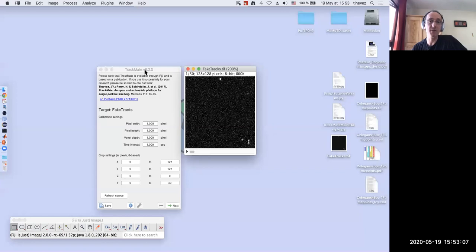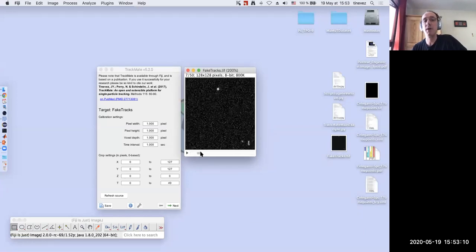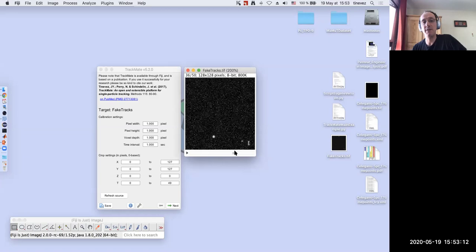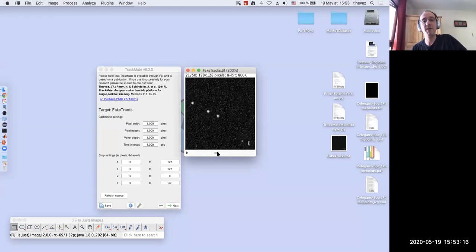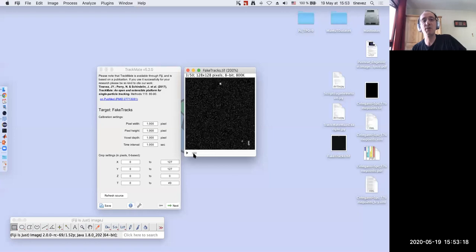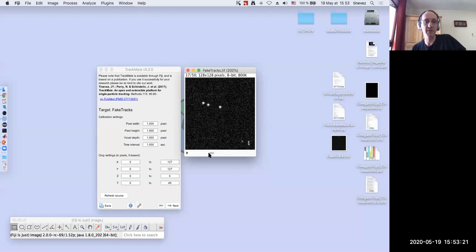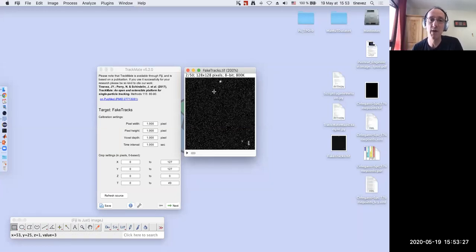TrackMate looks like this — a synthetic image of a time lapse with objects that divide and merge together. It's a very simple image with very few spots all moving in one direction. It's an easy image to track, just to show you how TrackMate works.